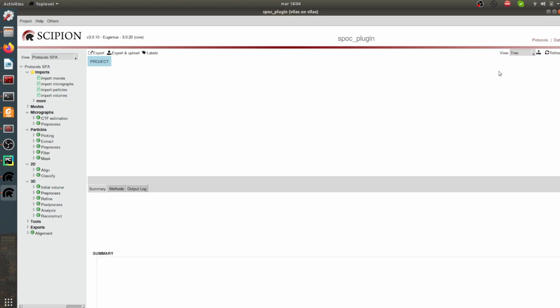The protocol we are going to explain uses statistical methods of permutation testing and false discovery rate control applied to the resolution-dependent correlation measure. The approach allows fully automated and mask-free resolution determination based on statistical thresholding of the FSC curve.